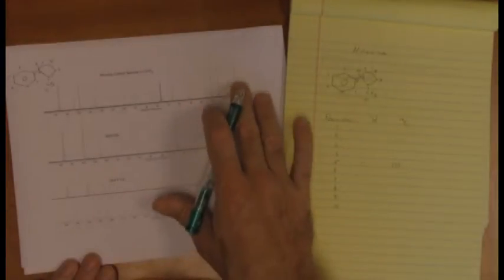So one of the most obvious things that you should begin after getting all the structure written out is I would look at the carbon, and I would write in above every one of the carbon peaks, and you notice they're all there: 1, 2, 3, 4, 5, 6, 7, 8, 9, 10. In a molecule with 10 carbons, they are all present. No symmetry in this thing. Then I would mark what kind of carbon they are.